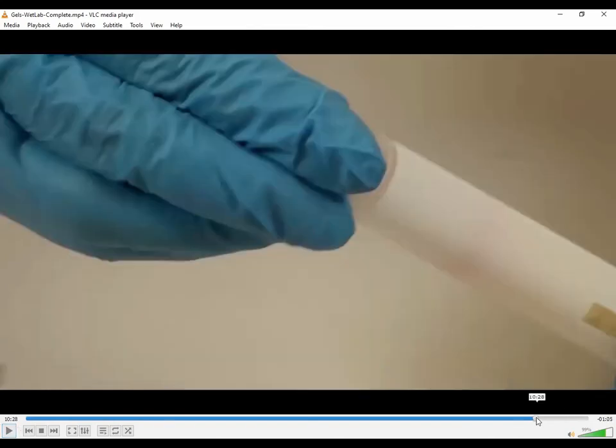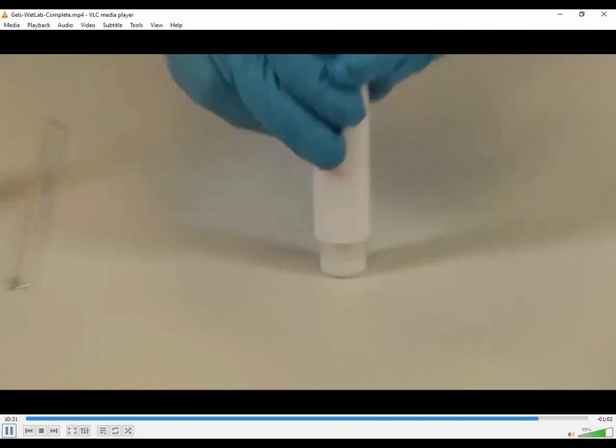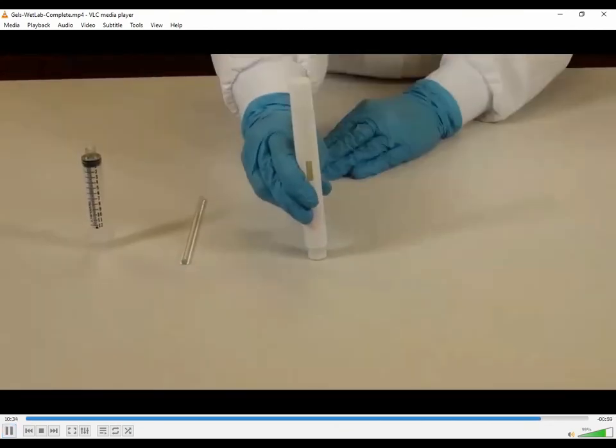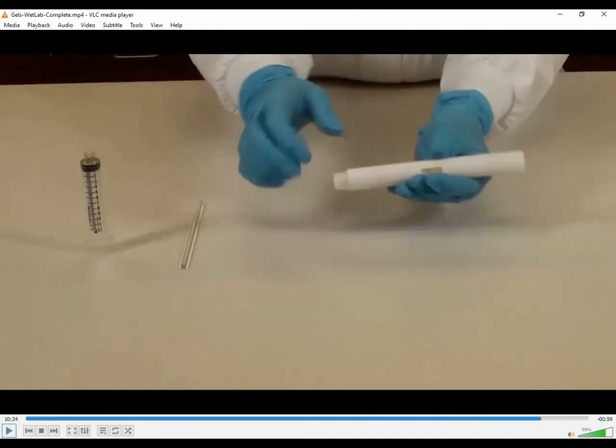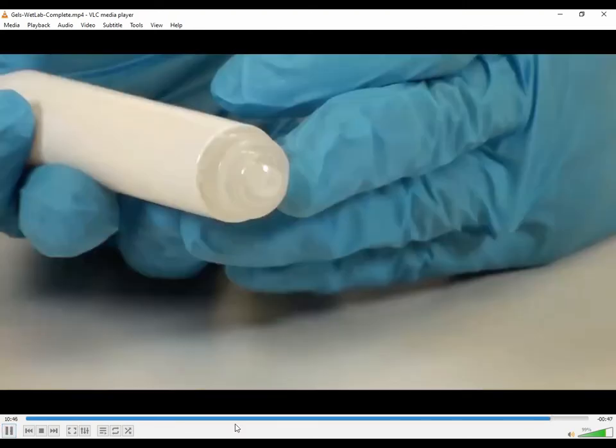So once you've made the airtight seal with the red cap, then you're going to put the white cap on. And then you can go ahead and use the countertop until it clicks on. So that outer cap is just pushed, and then you turn it upside down and push hard enough to where you hear that clicking sound. And that's essentially the lock and the button that will allow it to kind of squeeze out, because the whole point of this pen is to dispense the gel from the top of the AccuPen.